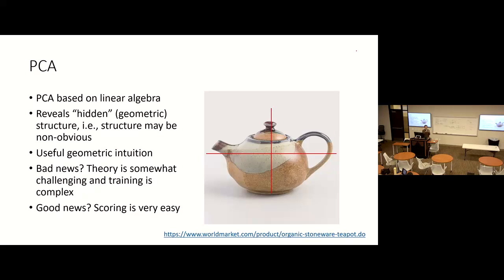You don't want the 3D data points to be superimposed onto each other when you see the 2D. You want them to disperse as much as possible. So PCA helps you find the rotation matrix to give you the right angle to see the object, so the data points on the object are separable.